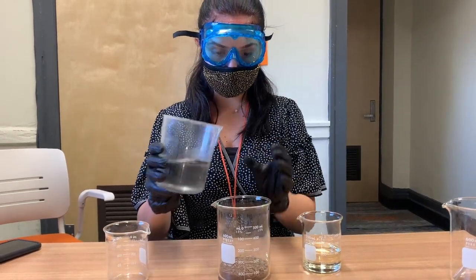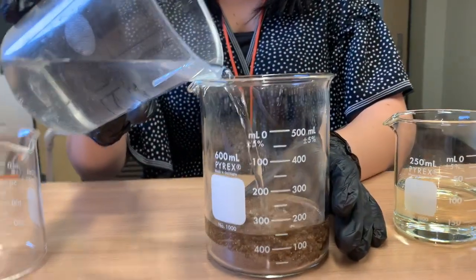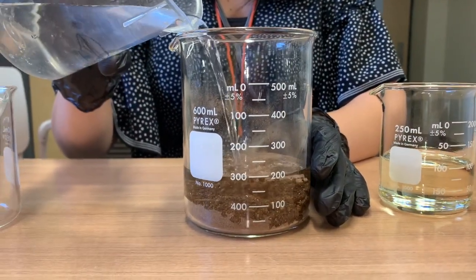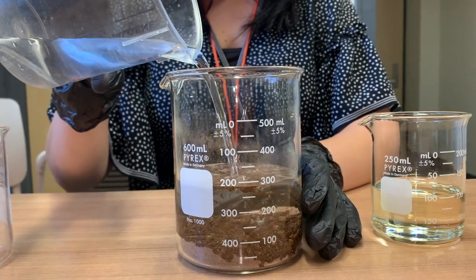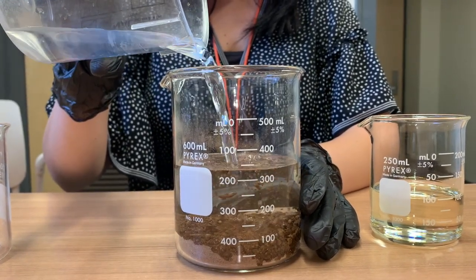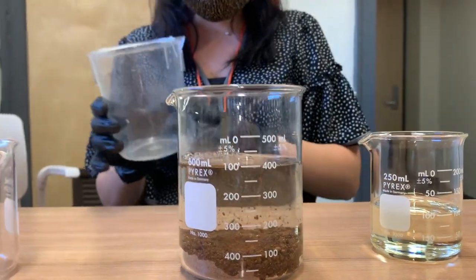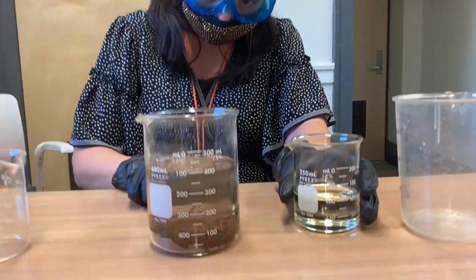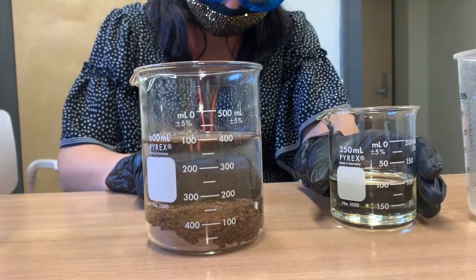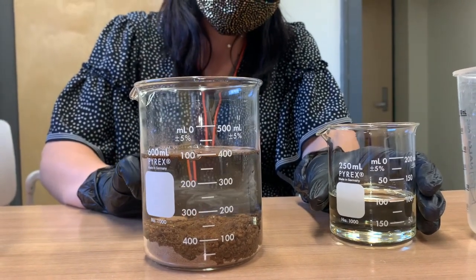Now we're going to be pouring in the water. Notice how you have some particles floating, but for the most part, the dirt is going to be settling to the bottom.